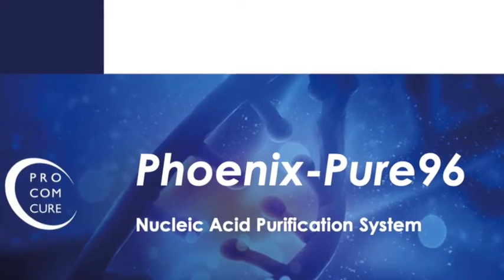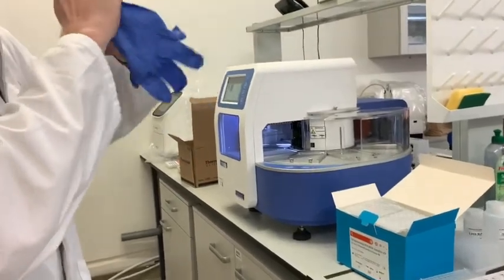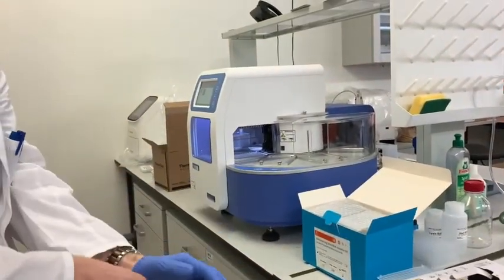Thank you for purchasing the N96 automated extractor. Before we begin the session, please make sure to wear your gloves to avoid contamination.